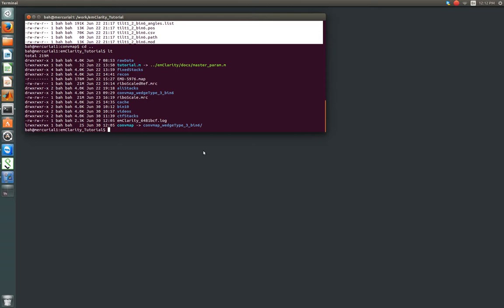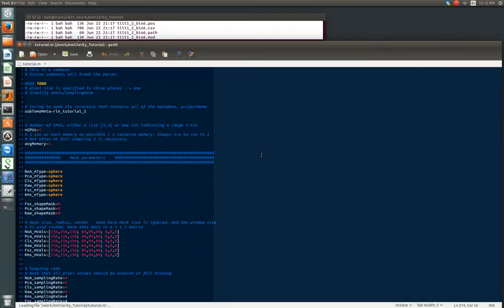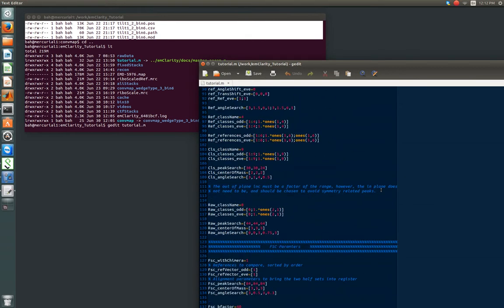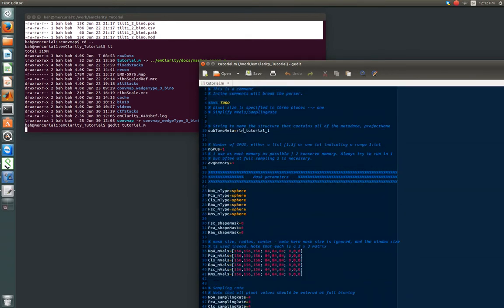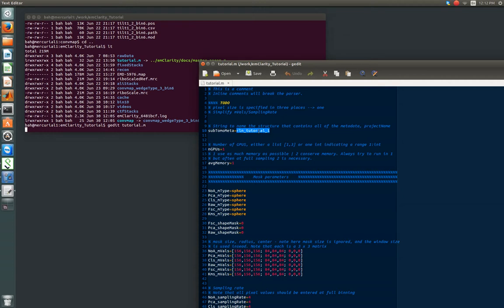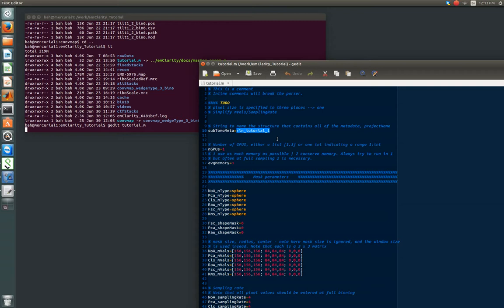And the next thing that we want to do, we'll of course, as we've done, open up the parameter file and point out the relevant details. So we're going to go the whole way up to the top now. And this is something that now comes into play. This subtomo meta is basically, what that means is just the binary file that stores all the data about your subsequent experiments. And you give it some name that can have numbers, underscores, and letters. And that's it. No other special characters. And it needs to start with a letter.